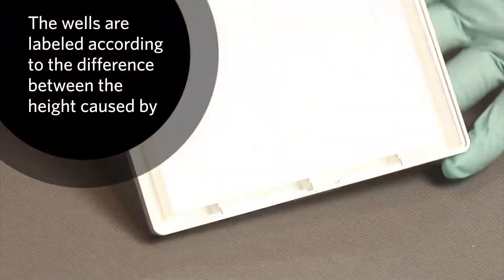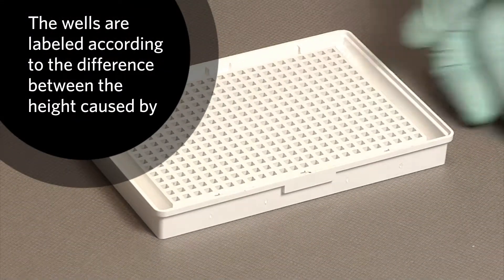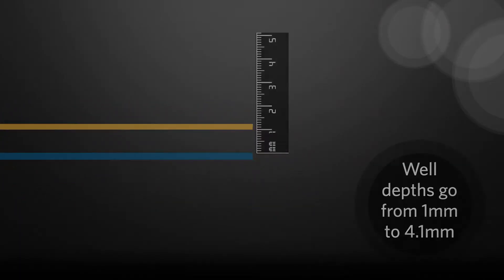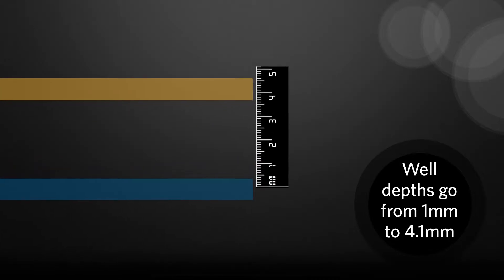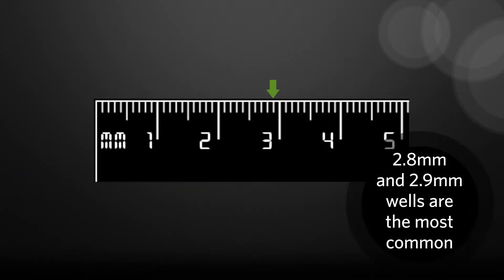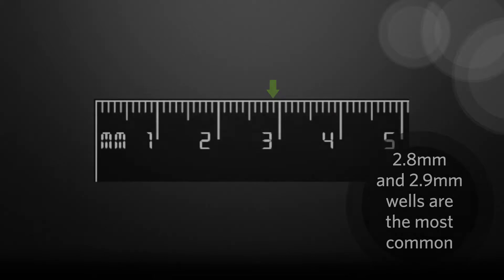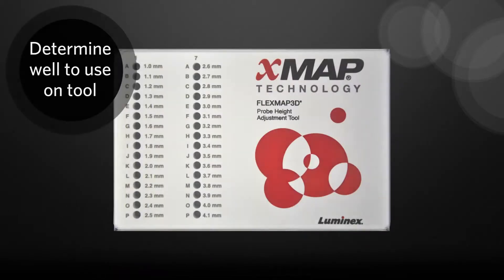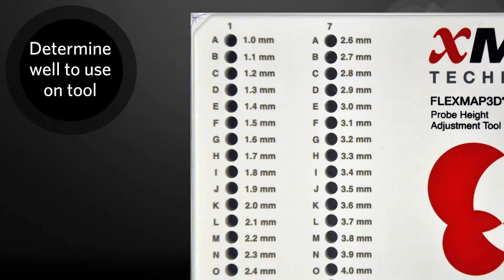These wells are labeled according to the difference in height caused by the space between the bottom of the well and the bottom of the plate, which ranges from 1mm to 4.1mm. The most common used will be the 2.8mm and 2.9mm wells. Here's how to use the probe height adjustment tool. First, you will need to determine the correct well depth to use on the probe height adjustment tool.